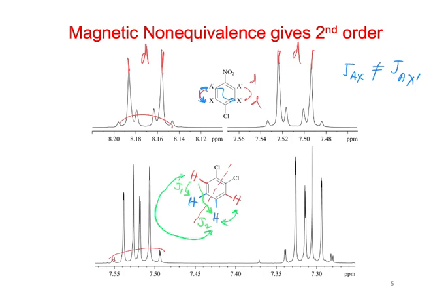and some weird splitting on the tops of those. But again, if we kind of ignore this bottom stuff, then we could just call this a doublet of doublets. Right? Ignore these small splittings here, too. And so we would just be seeing this split, kind of an ortho coupling and a meta coupling. Okay, but they are more complicated than what we would expect here.